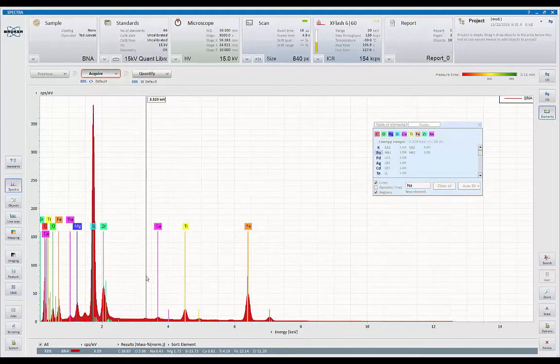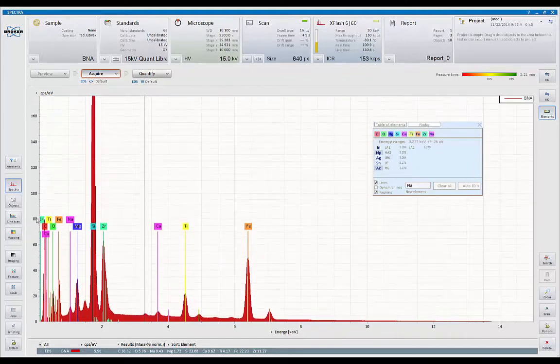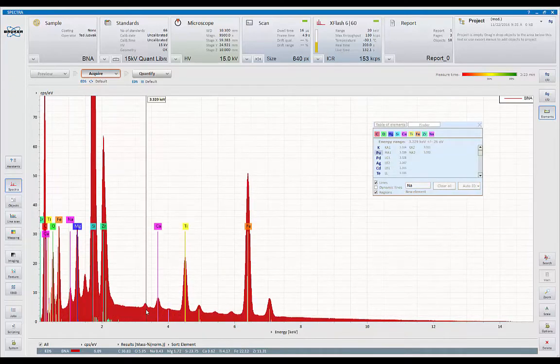Okay. You can also use the computer assist ID. So if you're not sure of what element to select from, you can go to a region and either simply place the cursor in the center of that, or if you want a larger sampling, press the right mouse button and drag it and you'll get a larger region of choices. So these are the choices within that region. And as you see, the two main lines are potassium, which makes perfect sense, and indium. Now, if that were indium, I'm missing a lot of lines here, and I'm also off center. So potassium makes the most sense. So with that, I've identified potassium in here.